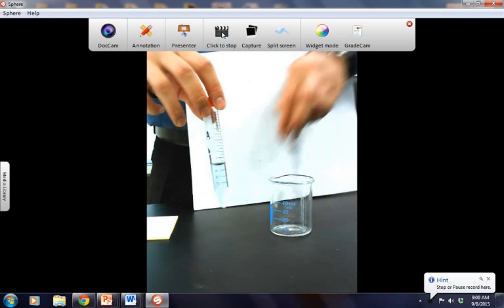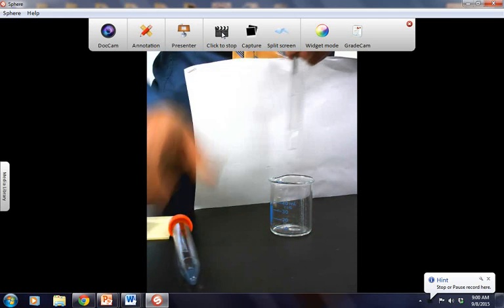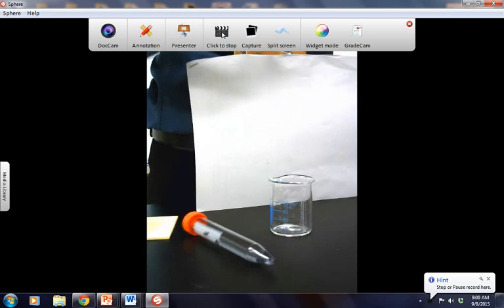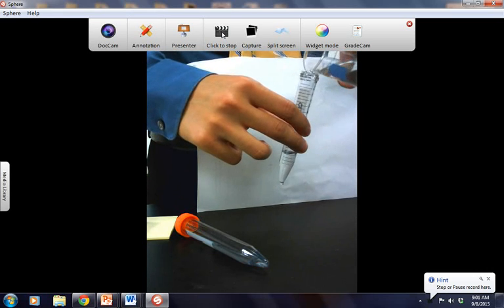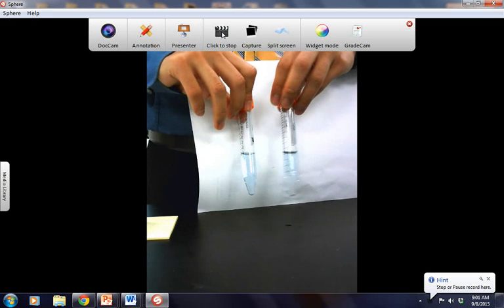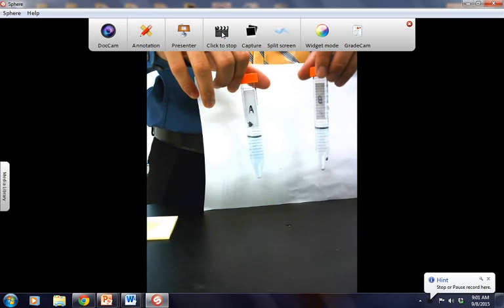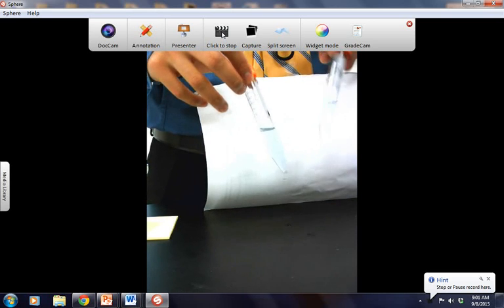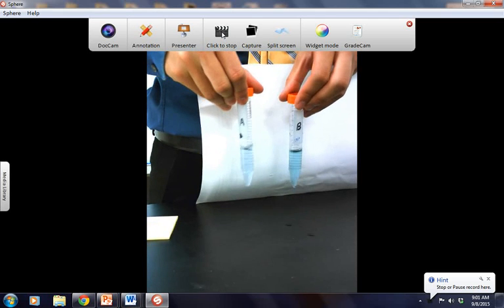I'm going to do that right now. Tube A is still a little blue and B is still clear. For experiment two, we are now going to go ahead and shake them both. I'm going to do the kaboom again. Take a look and make some observations on both liquids.